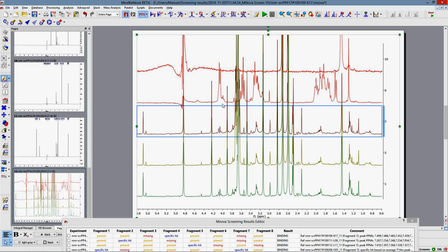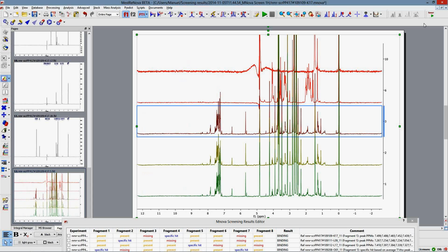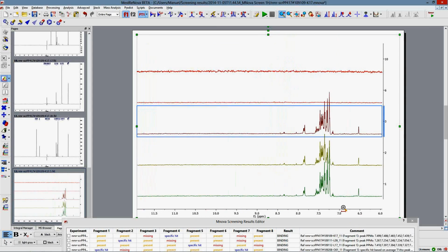And again, I would argue that most of that is going to be buffered. But, well, let's say that we have a little bit lying around the 4 ppm region. Okay, so in our particular case, we are not interested in that region at all. Like I was saying, we are just looking at the 6 to 12 ppm region.